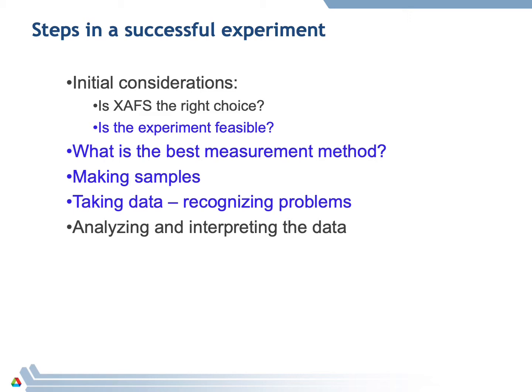Some of the initial considerations are that you should really consider: is XAFS the right choice for the experiment? XAFS has its strengths and weaknesses, but if you have, for example, a crystalline sample, maybe some type of diffraction measurement might be better. Also, you might consider, is the experiment feasible? If your sample is too dilute, the element of interest is too dilute, it may be very difficult to actually carry out the XAFS experiment. We'll discuss this in later slides.